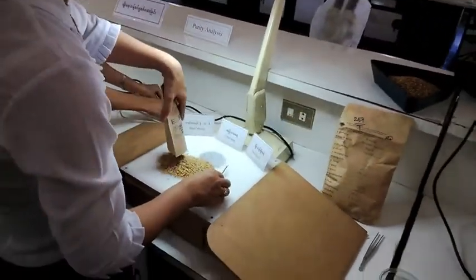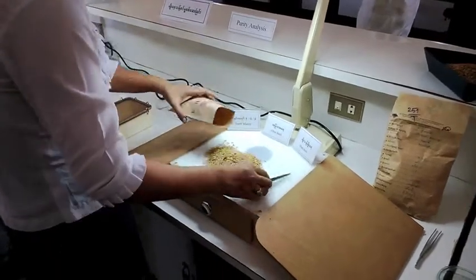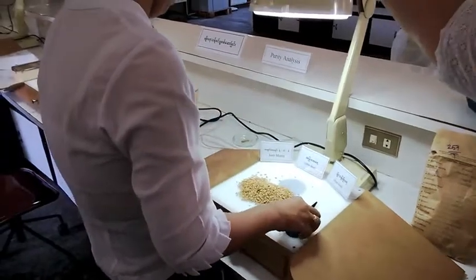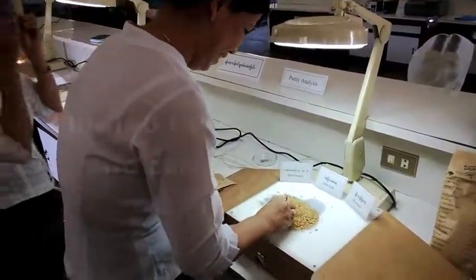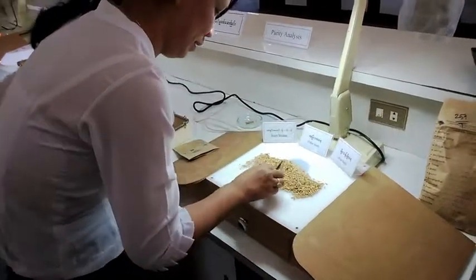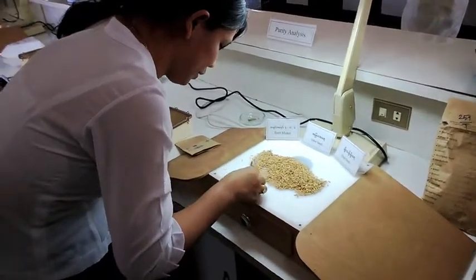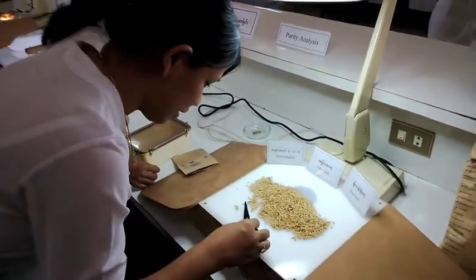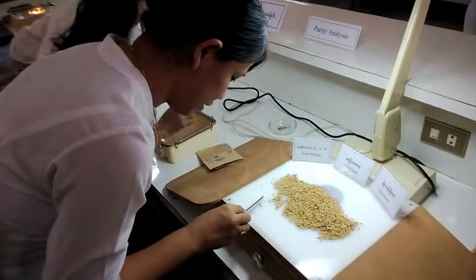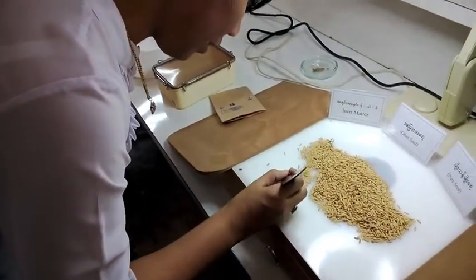She puts the 70 grams onto this little table. Then she has to use her eyes and also the lamp — a very precise job. She's trying to identify the Valonia and see if they are all the same. If something is different, she will take it out — those are off-types. For example, that little grain is an off-type, so she takes it out.